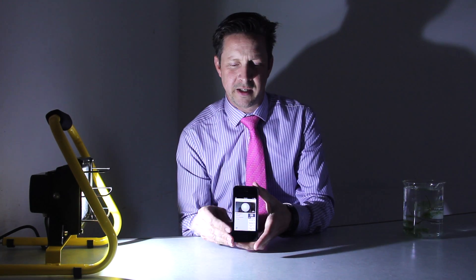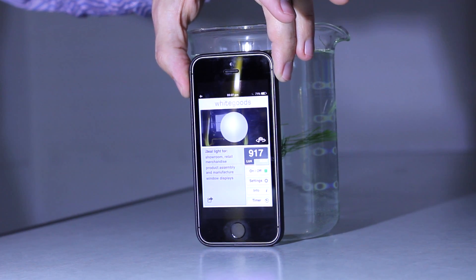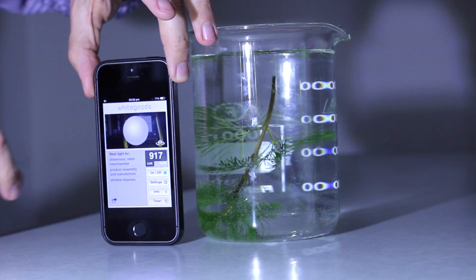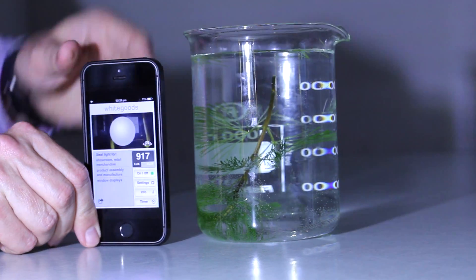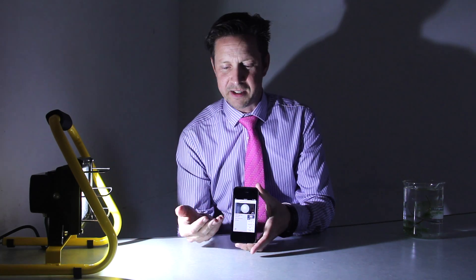Now you can use a light meter on a phone to measure light intensity in LUX, which is exactly the reading that we want to record on the graph alongside the rate of photosynthesis.